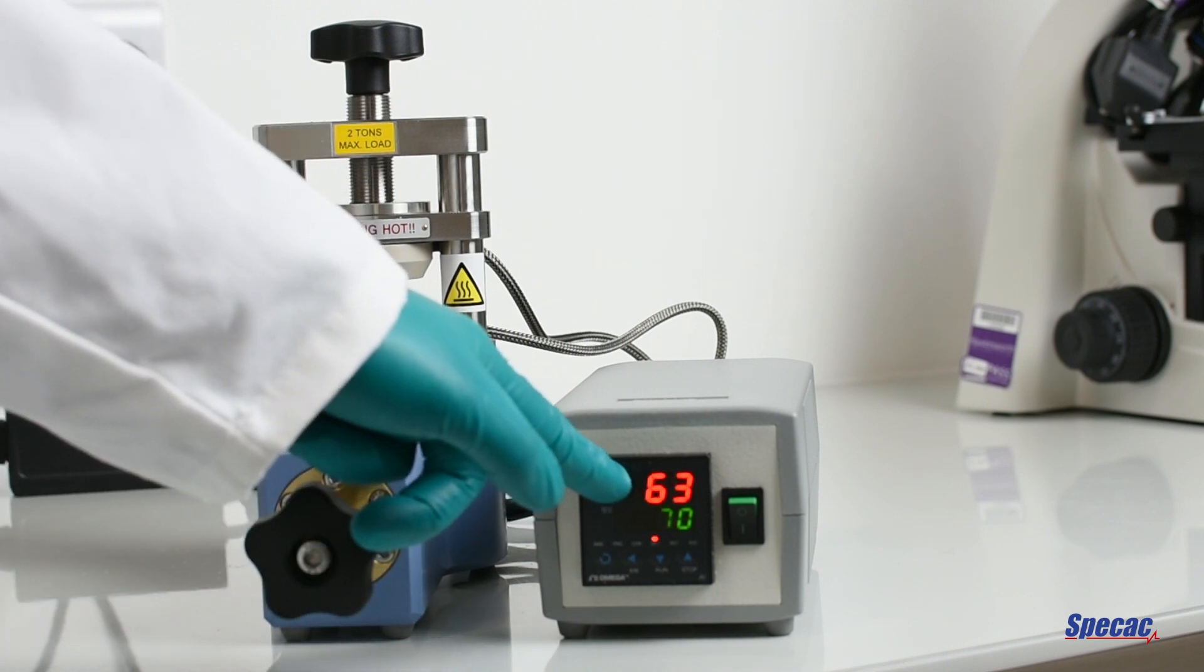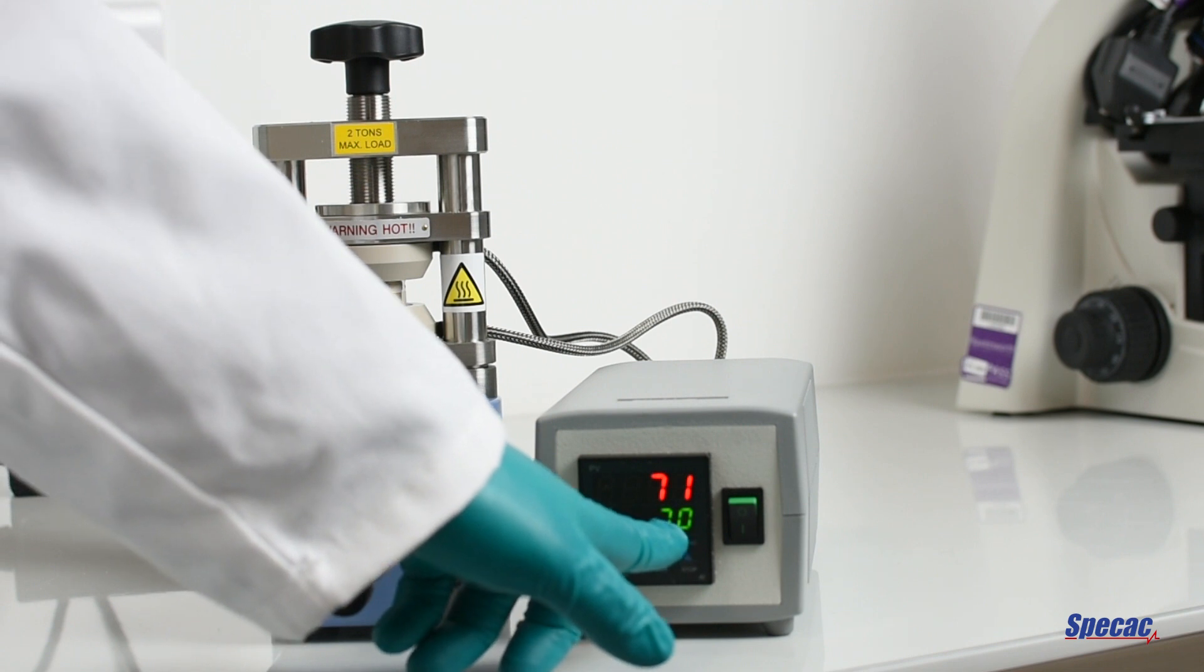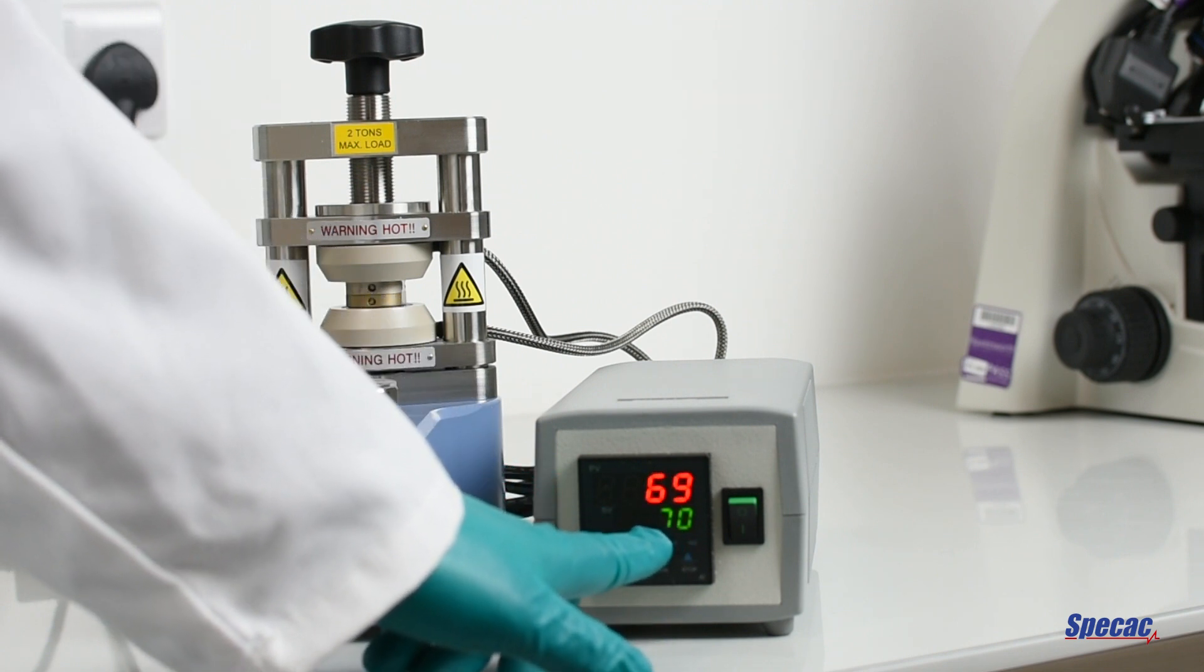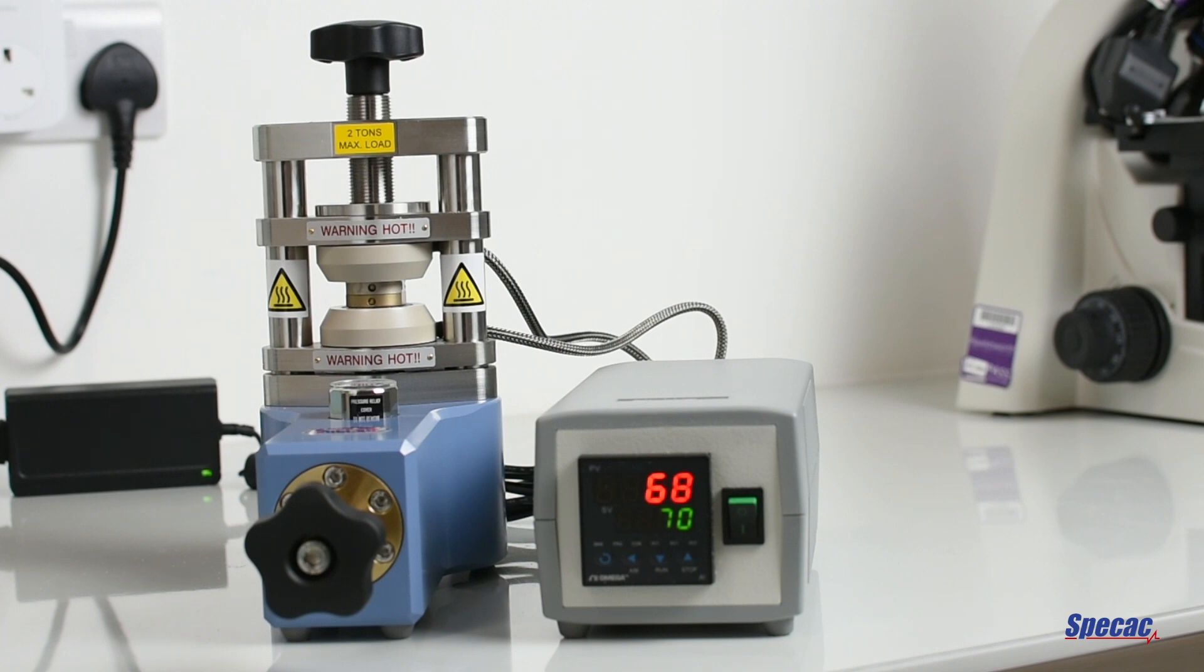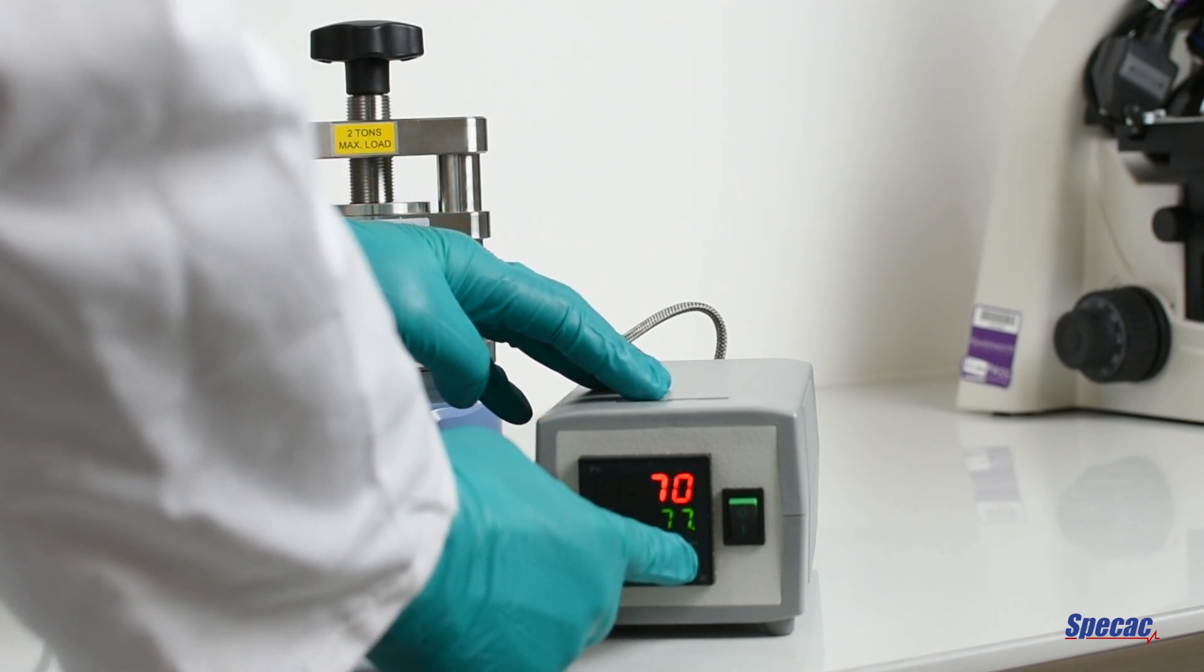The top value is the current temperature. The bottom value is the target temperature. Set a value somewhat above the melting point of the polymer using the up and down keys on the front of the controller. In this case we're setting 130 degrees.